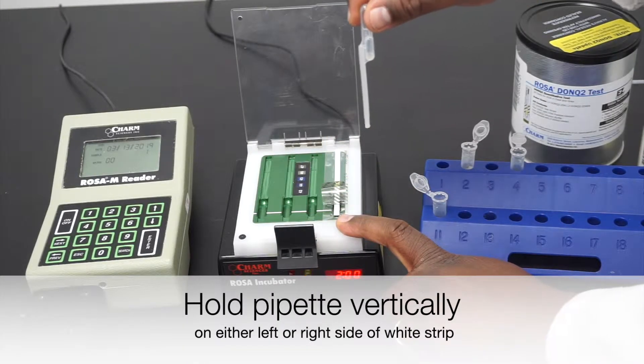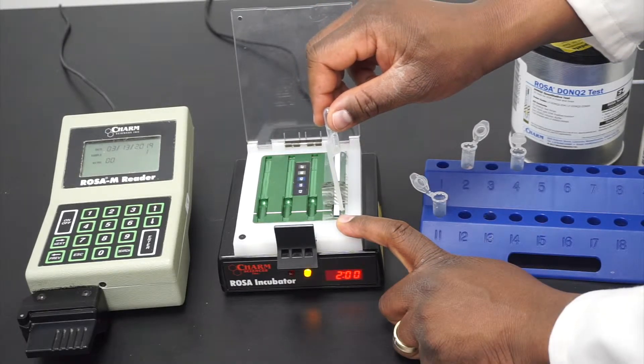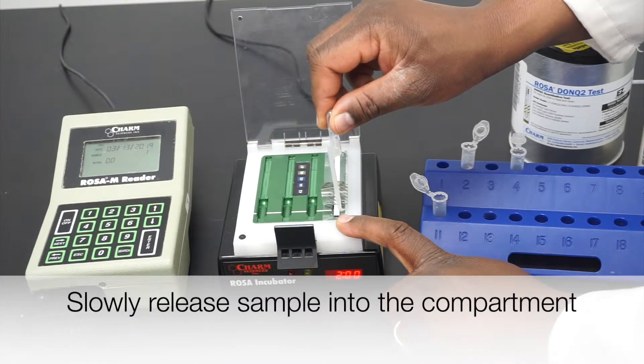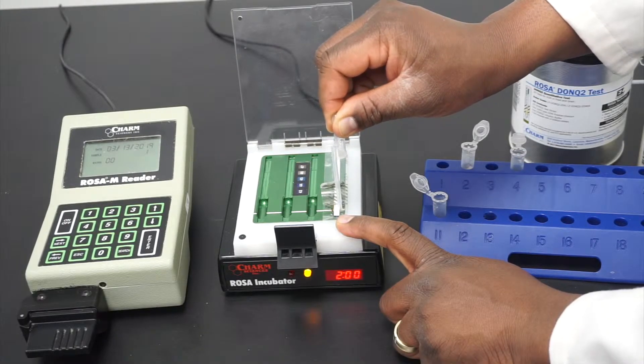Holding the pipette vertically, position it on the sample compartment on either the left side or the right side of the white strip. Slowly release the sample into the sample compartment by gently squeezing the top bulb until the capillary of the pipette is empty.